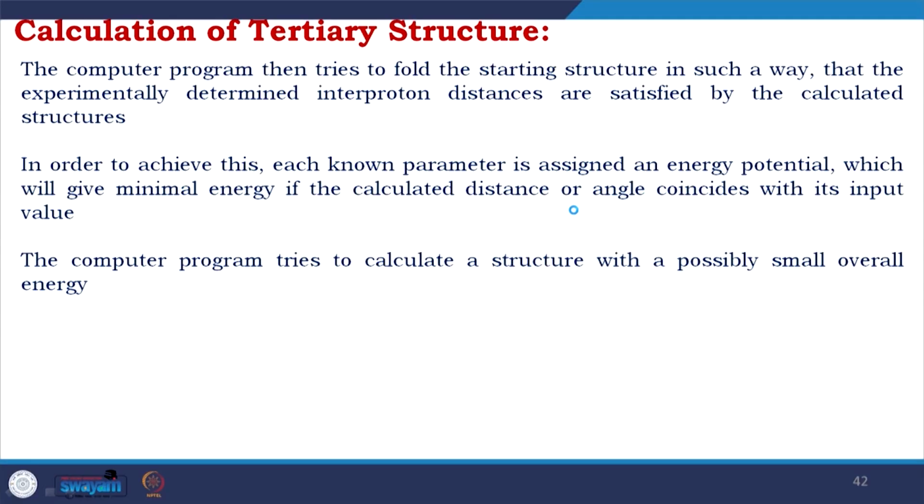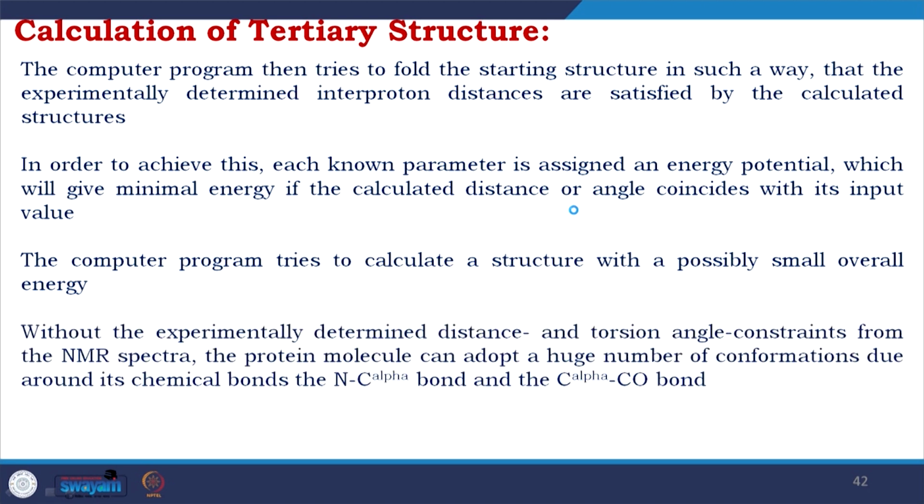Here in a similar way, you develop a cutoff and you start assigning those parameters and you keep refining them. By refining I mean go to the minimal energy. The computer program tries to calculate a structure with a possibly small overall energy.